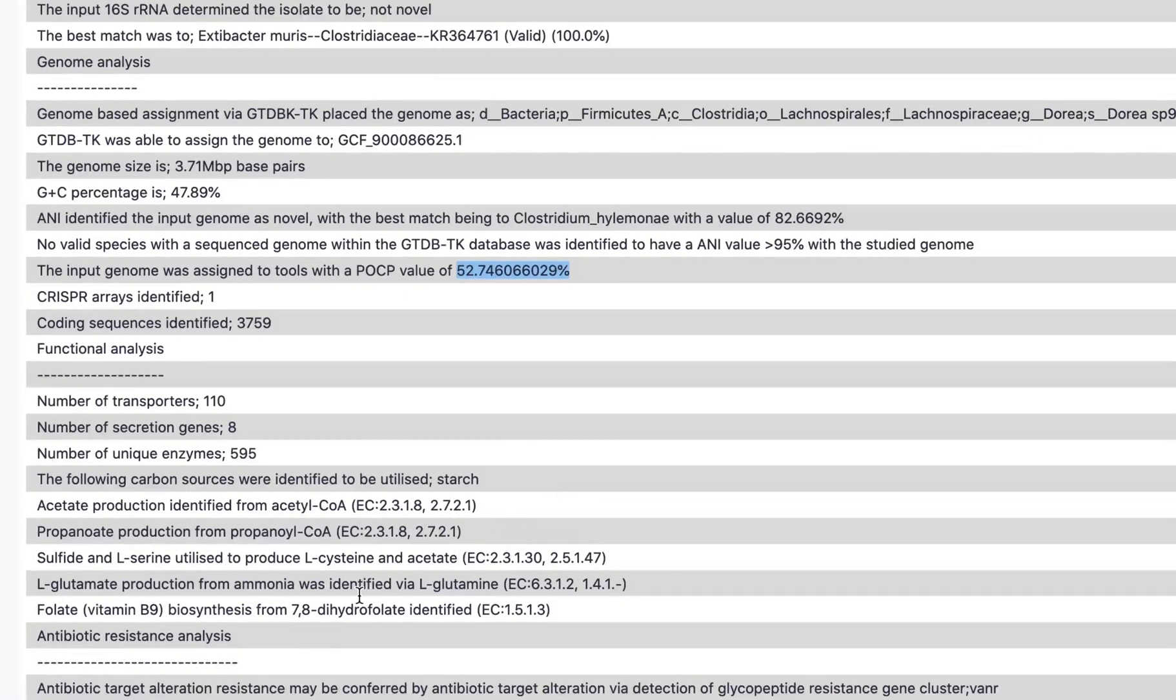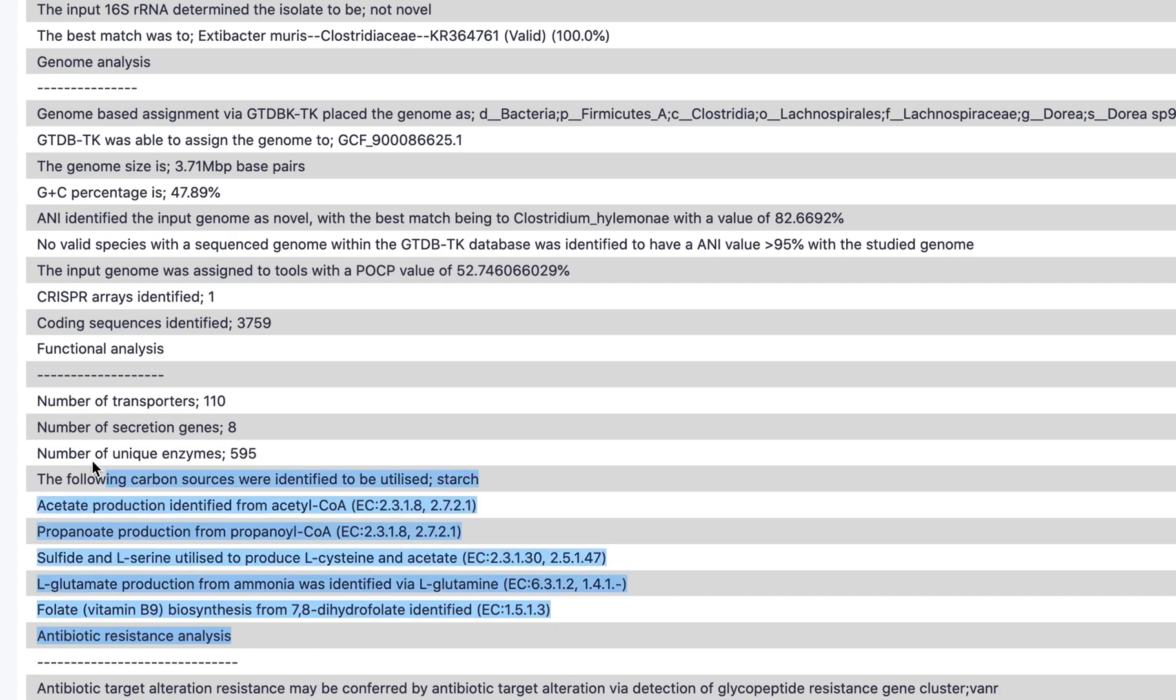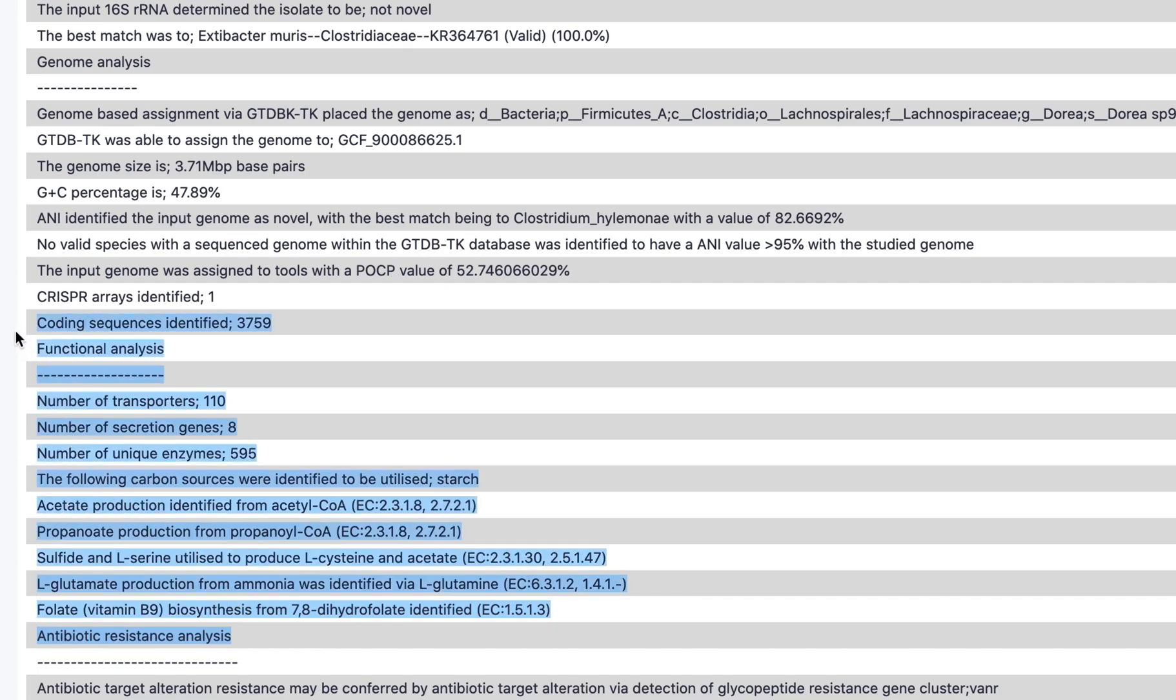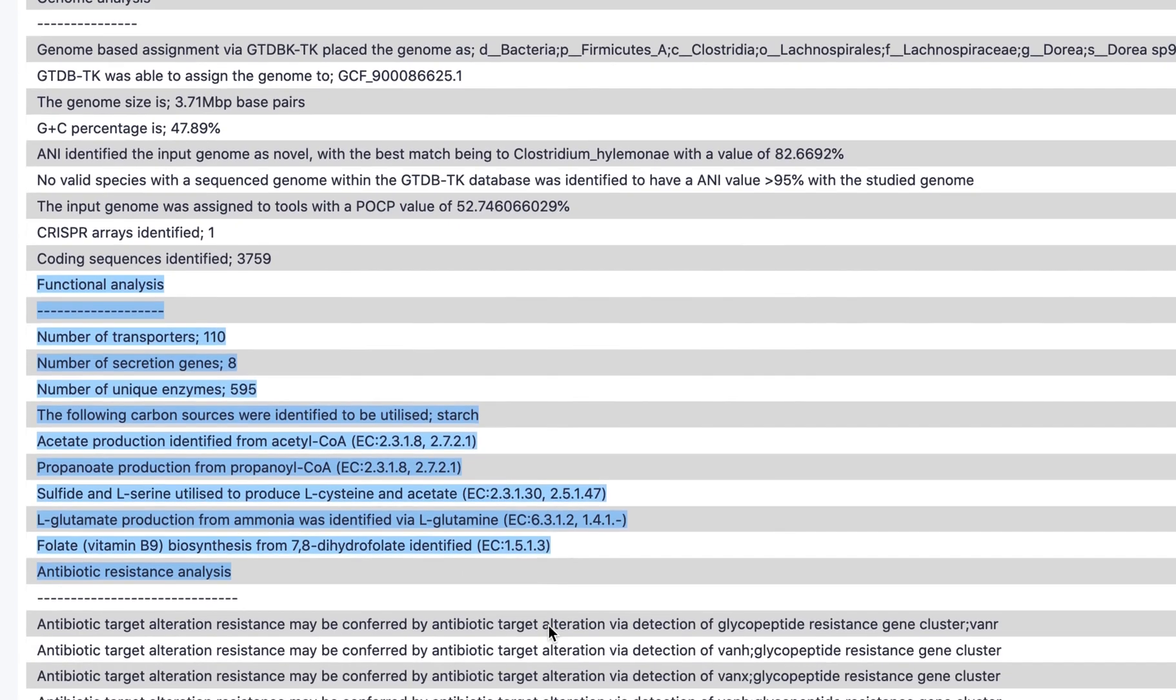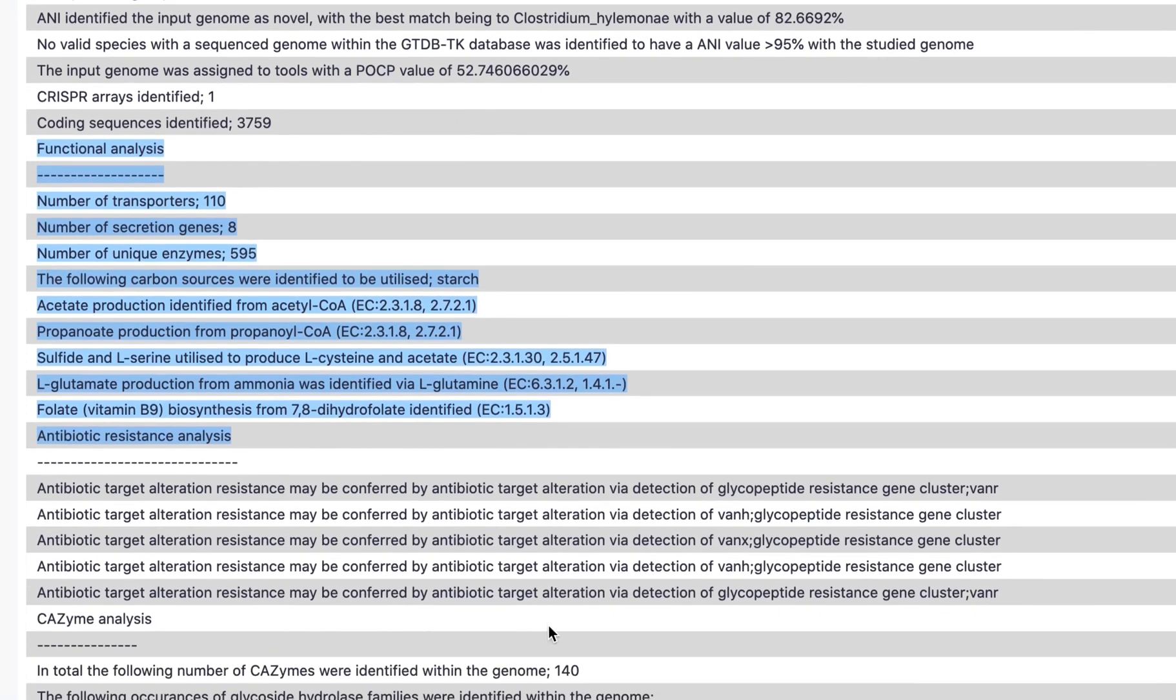Functional analysis is done in four parts: general features, pathway analysis, antibiotic resistance, and CAZY analysis. General features include the number of transporters and enzymes.